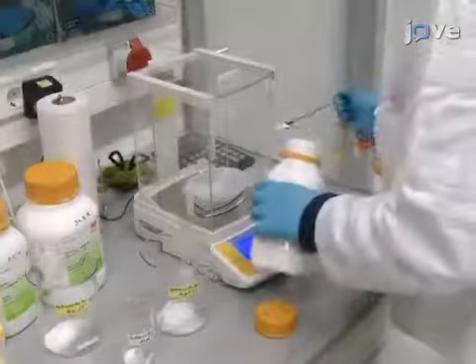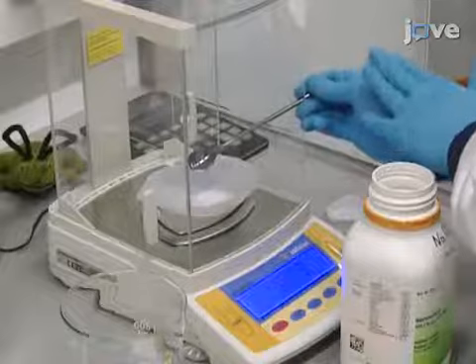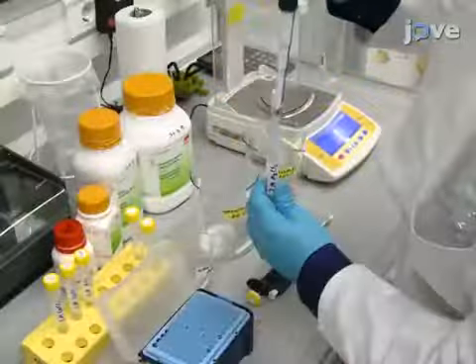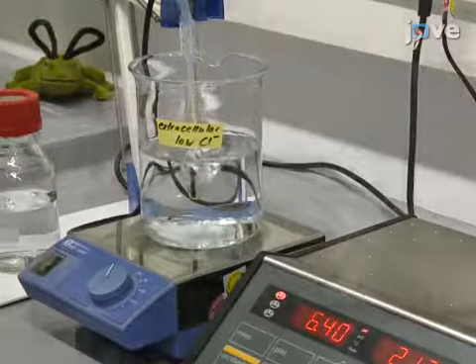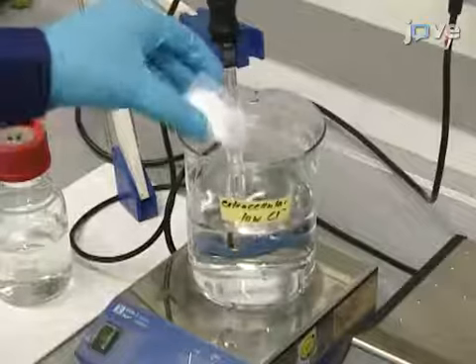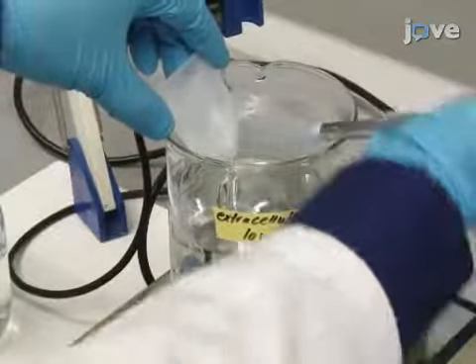To begin this procedure, weigh the solid components for 100 milliliters of the intracellular and 500 milliliters of the extracellular buffered solutions in separate beakers. And then add the respective amount of the prepared stock solutions. Next, add ultra-pure water and carefully adjust the pH using acids and bases. Then, adjust the osmolarity with glucose to 290 milliosmoles and 320 milliosmoles for the intracellular and extracellular solutions, respectively.